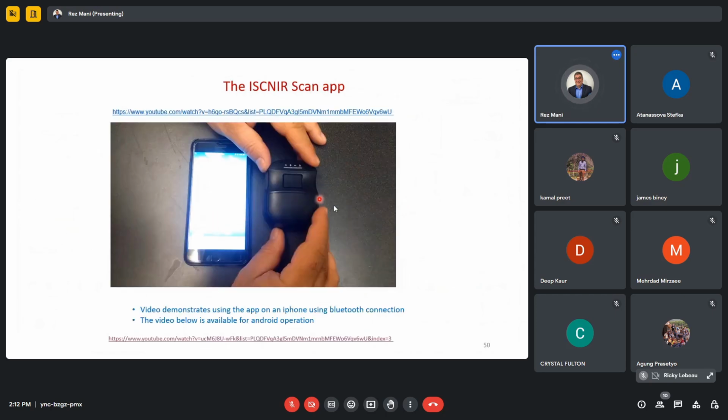Here is the app. The app is compatible with Android and the App Store on iOS. You can download it for free from Google Play or from iOS. I've demonstrated a video here on how to run the app.